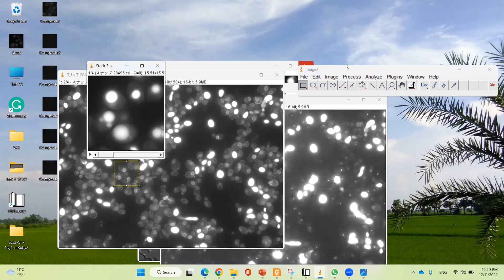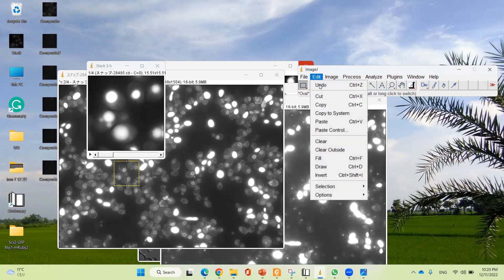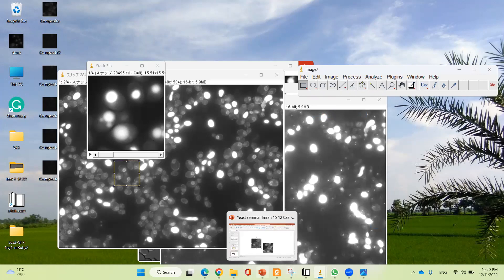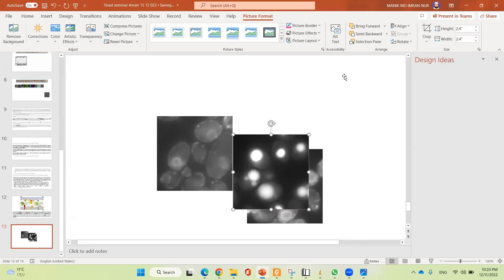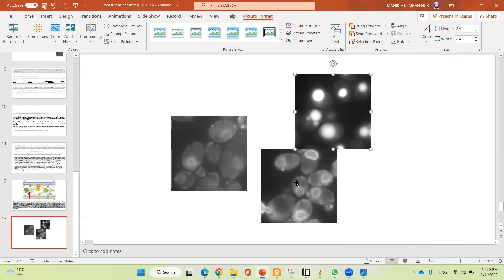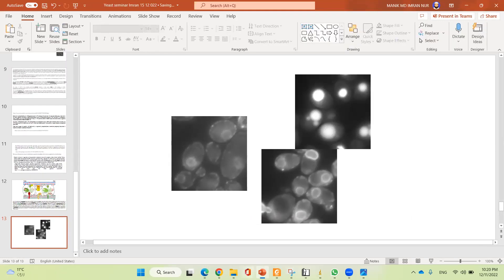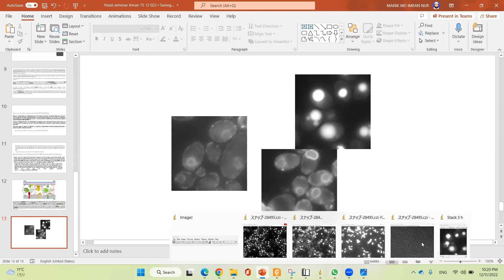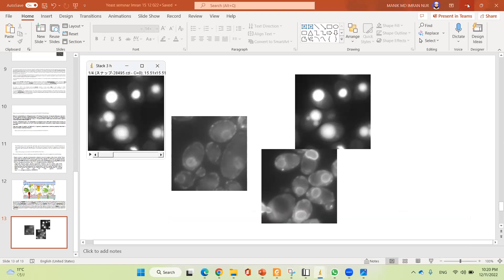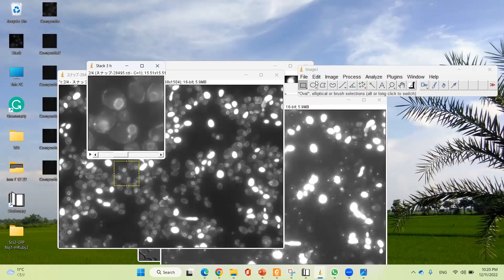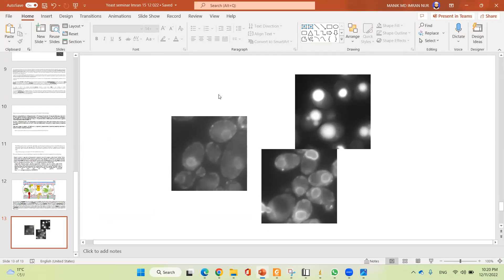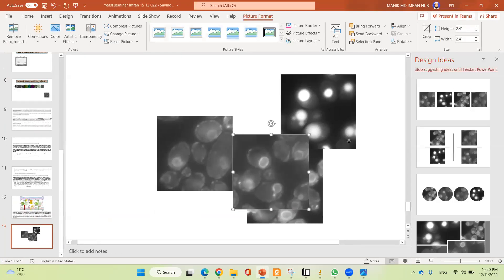If you want to copy each image, go to the Edit option and select 'Copy to System', then paste the image. This is the first image. Then go back to the stack, select the second one, go to Edit, Copy to System, and paste. This is the second image.